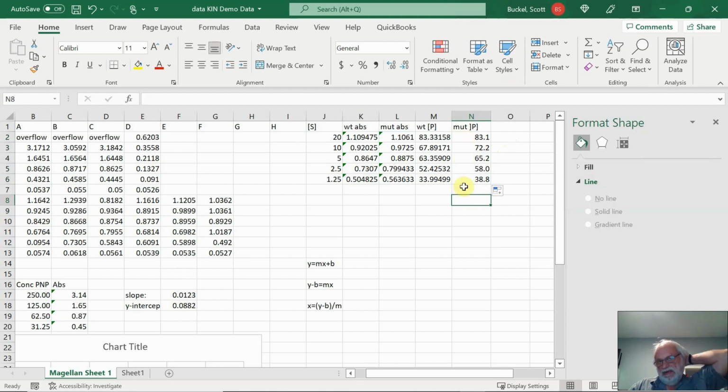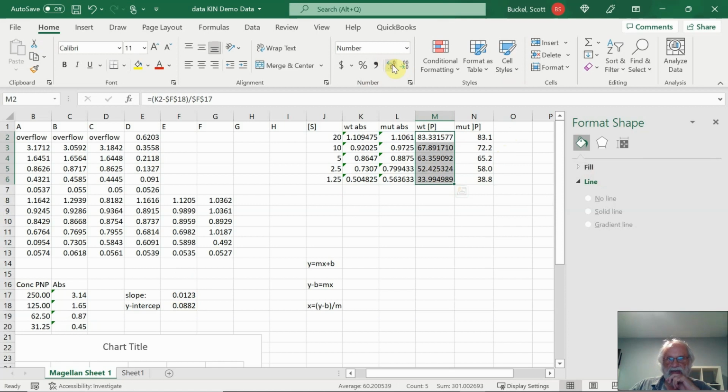And we see here we've calculated them. Here, that's too many decimal places. Let's go ahead and make it less decimal places. I think 1 decimal place is more than sufficient for this. So we see the value. So now we have the substrate concentrations, and now we have the velocities. So we had this much product produced over the length of time that you incubated the plate. If you want to, you can convert. We did about 20 minutes, so you could divide it by 20. I'm just going to go ahead and leave the values just the way they are.